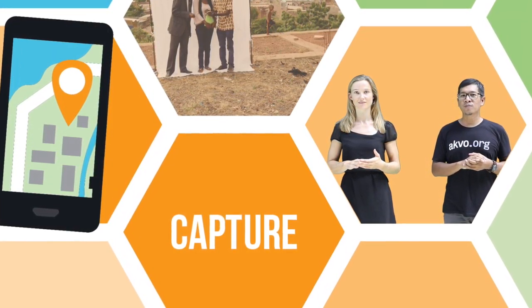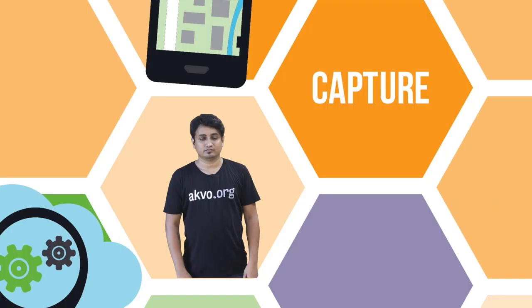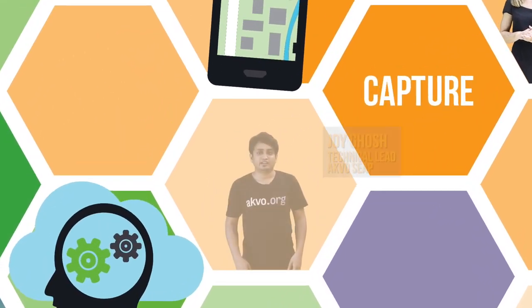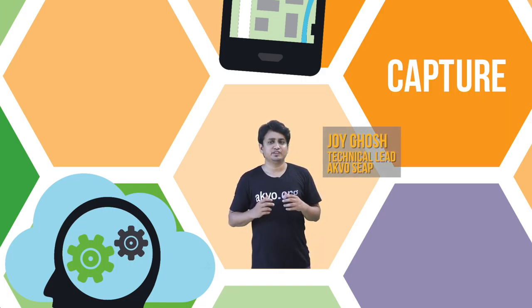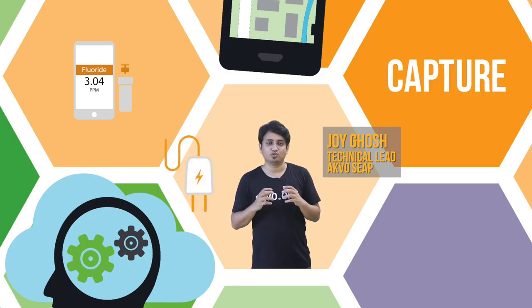To get a more detailed view of one of those field test kits, let's talk to Joy. So Joy, tell us a bit more about what we are looking at. At Akvo, we are developing various field tests which can form part of your data collection. All of these tests are integrated with the Akvo Flow app.